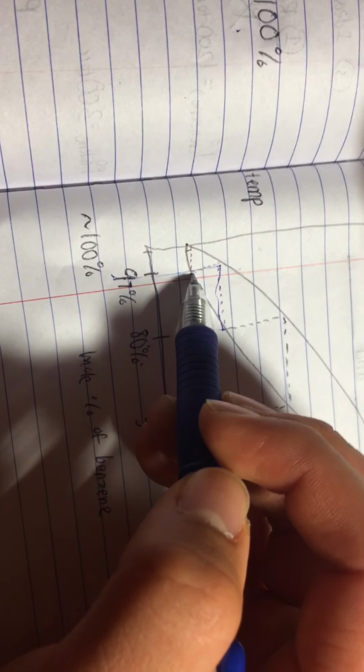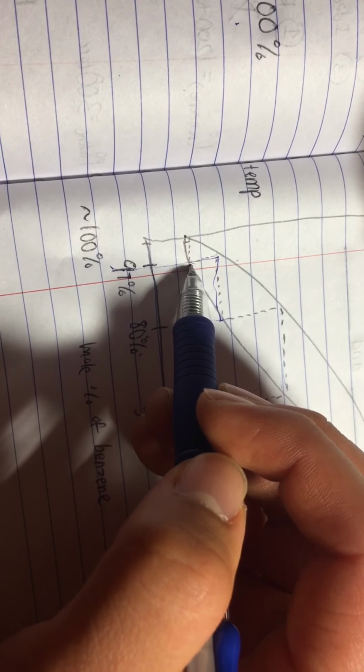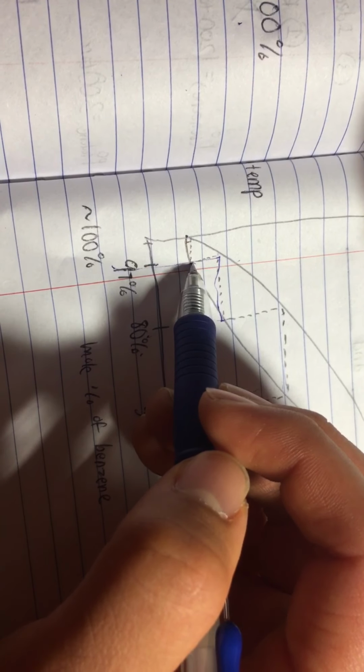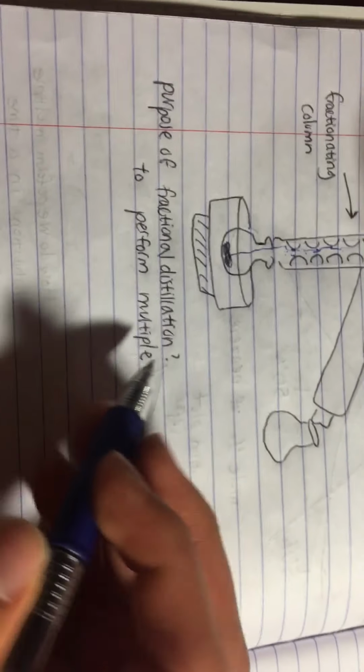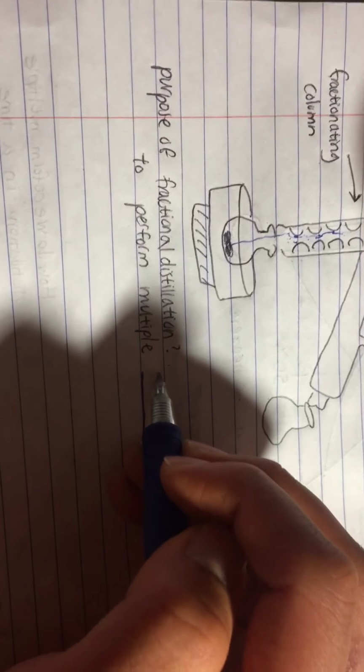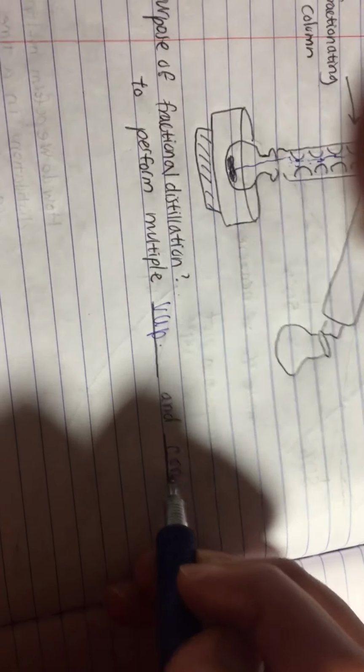So in theory, with this fractionating column, we could go through condensation and vaporization multiple times to achieve a near 100% yield. And so the purpose of fractional distillation is to perform multiple vaporizations and condensations.